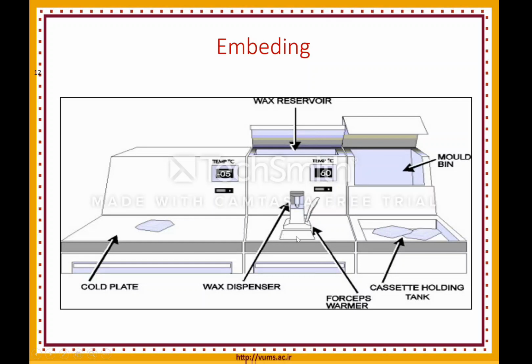We put the specimen here in a basket as you see here, and then we release the handle of the paraffin. In this part we first put the sample.